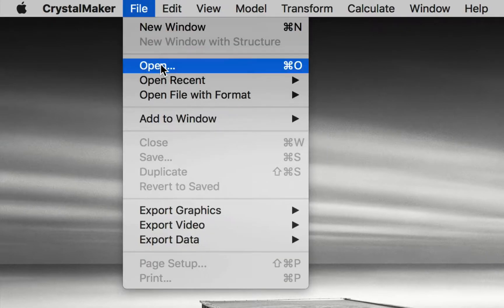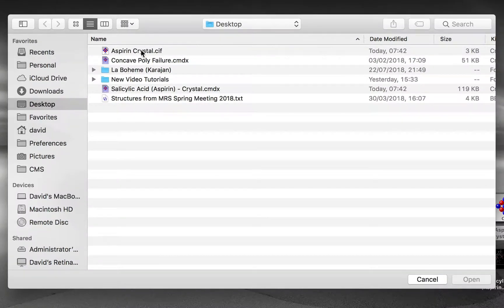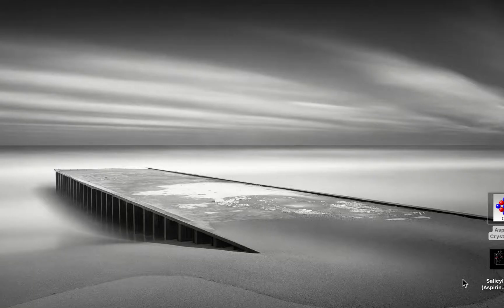We're going to use CrystalMaker's open command and open up the cif file.